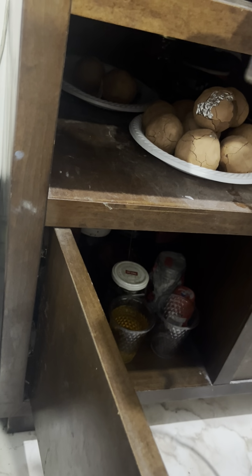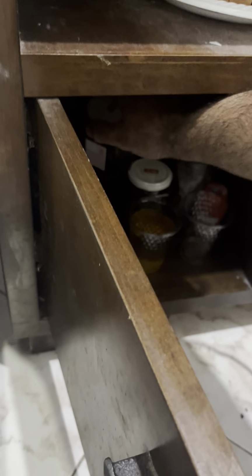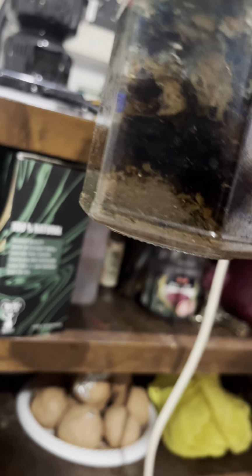Even though I kind of feel sorry for them. This is the water from the aquarium that is enriched with sodium bicarbonate. So this is the alien aquarium. You see it's filled to the top, and very nice, very promising.